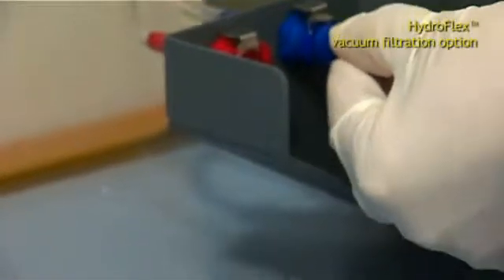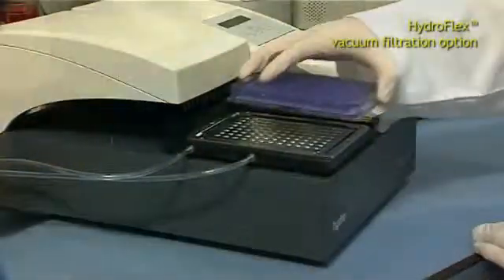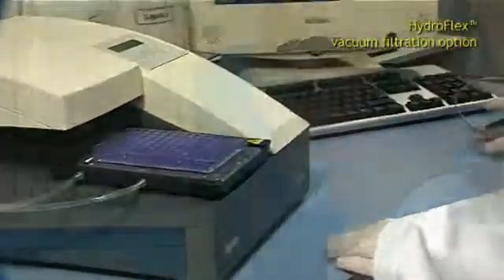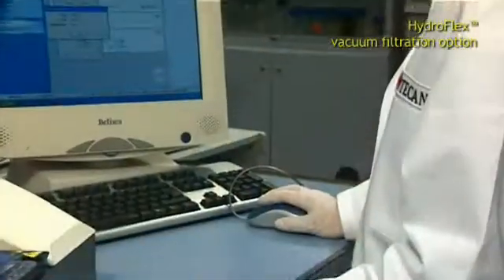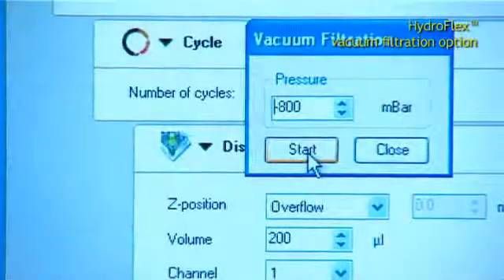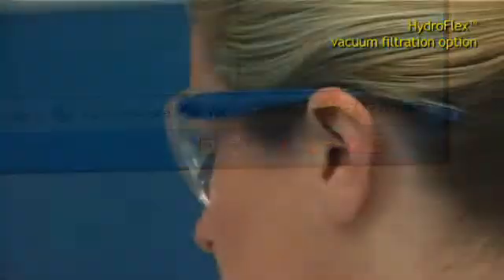The HydroFlex vacuum filtration option is the automated solution for high as well as gentle vacuum filtration to waste protocols. It offers a broad and tunable vacuum range from minus 50 to minus 850 millibar and is the perfect choice for filtration applications.